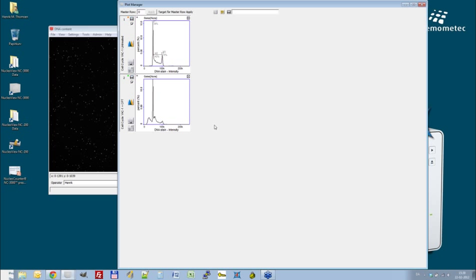we can here see the difference very clearly, that in the second sample we have a sub-G1 peak, we have something that looks like an arrest here in the S phase, and if we want to put the same markers on, we simply use the first one as a template for the second one.